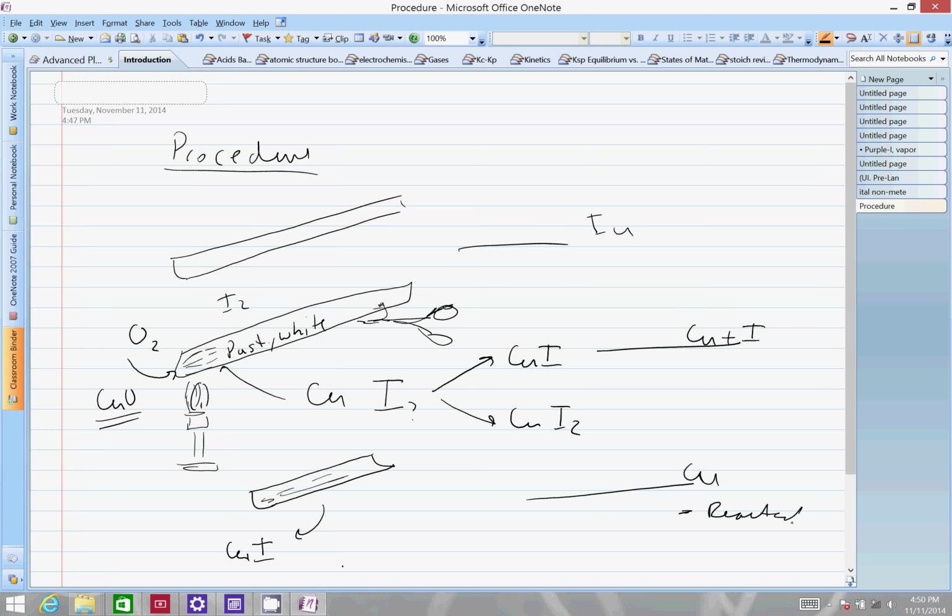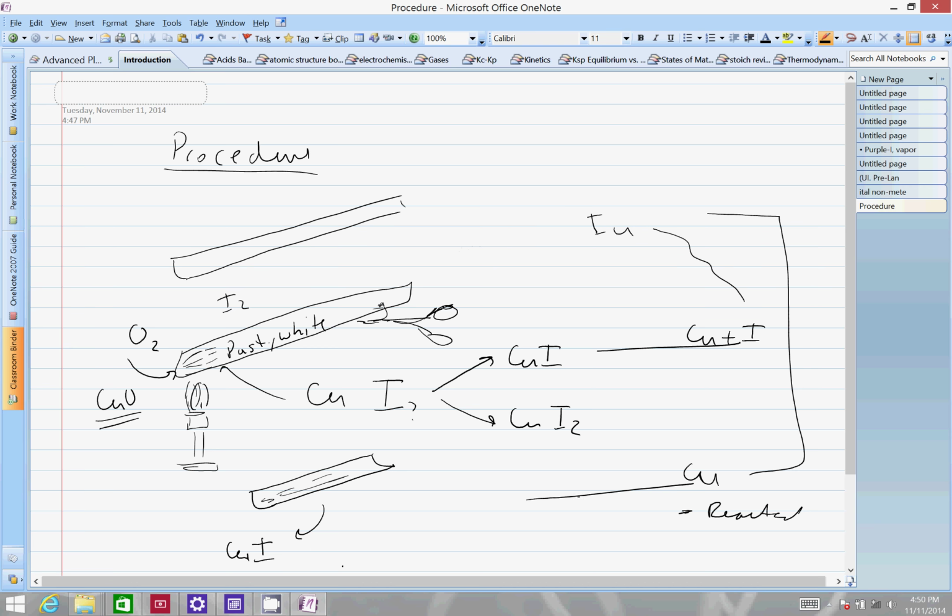So we could compare a few things and say, well, between the first 2 weighings is the difference between any iodine that reacted, and from the beginning and the end would be the difference between them. Hopefully it weighs less. Would be 1 in the sense that how much actual copper reacted, because we removed iodine, but the iodine wasn't in the first one to begin with. Now here, this is going to tell us, again, how much copper reacted. So think about that, and that's our reverse lab.